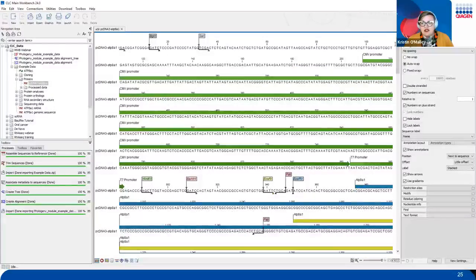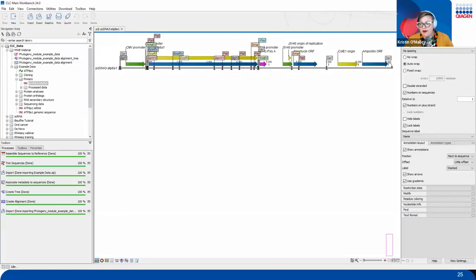In this case, I'm going to make it easy on us and use some of the zoom tools at the bottom right-hand corner. I'm going to snap this sequence to fit the window for the entire insert itself, so I'll click this center button. That's going to take the entire sequence and pop it into this screen, all fitting into one spot. So now we can see here is our insert.